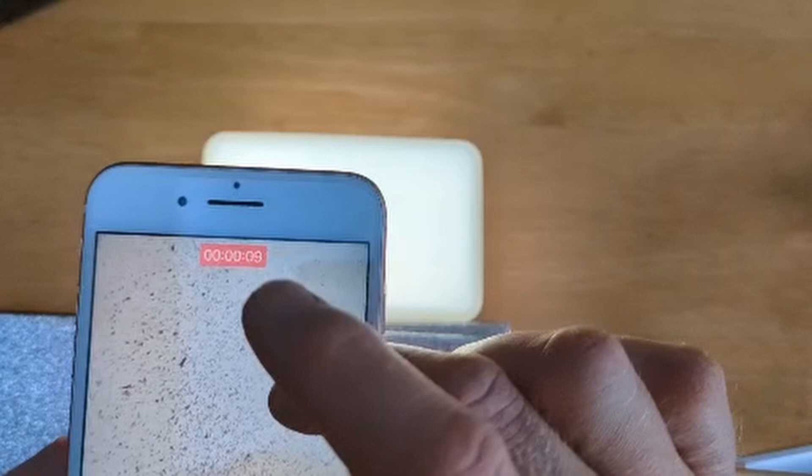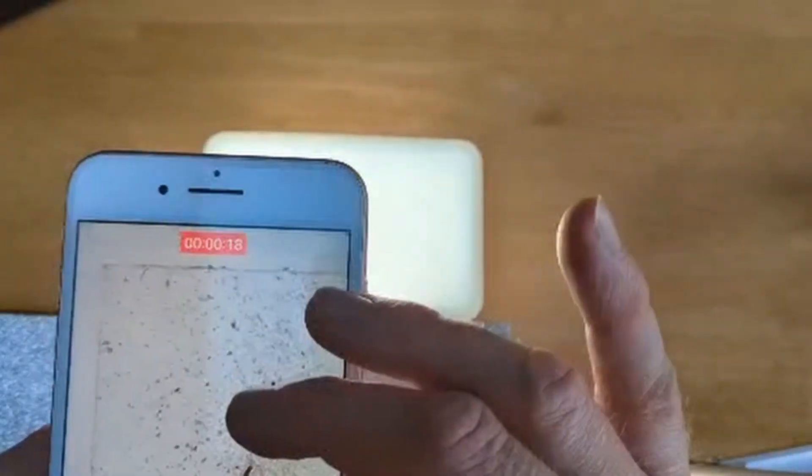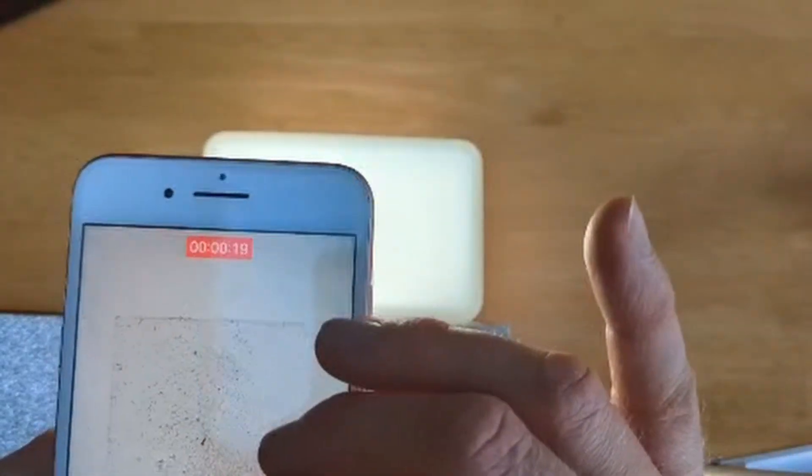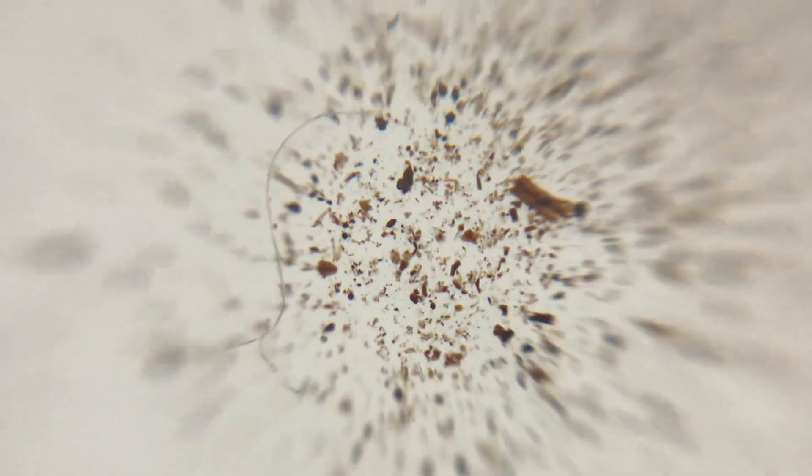But overall, I don't know what I expected really, starting the video with this comparison — battle of the lenses of a full-on microscope versus a smartphone camera microscope. I suppose the result was inevitable. The results are going to be fairly limited. And that they were. In terms of the detail and the level of magnification, I was moderately impressed.